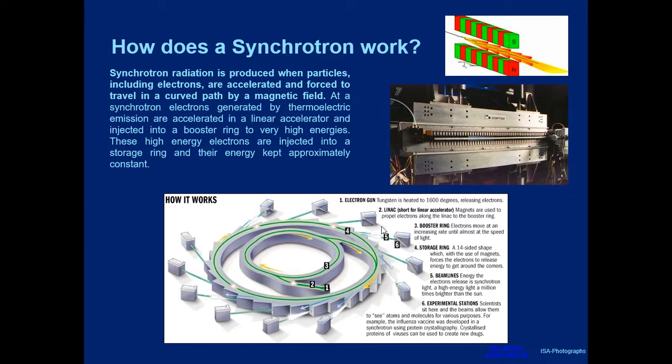Those X-rays get captured in a small lead tube, which funnels the light down into what's known as a beamline end station. This is where we have all of our experimental equipment. Again, the idea is to harness this X-ray energy and utilize that light energy so that we can analyze different types of compounds.